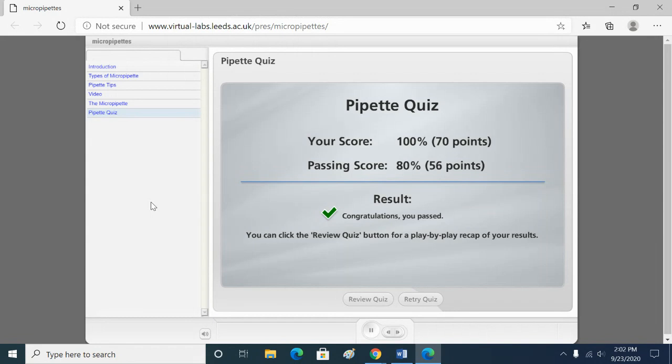it has some videos, it has a quiz, and you can see this morning we got 100%. And the people in the videos are British, and so they do not say pipette, they say pipette. So if it sounds kind of funny, they're saying micropipette.